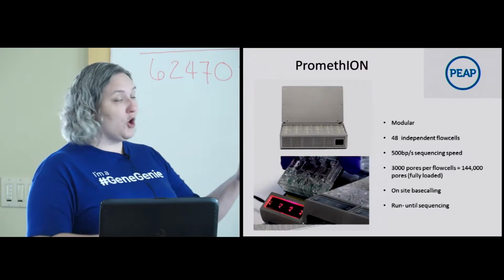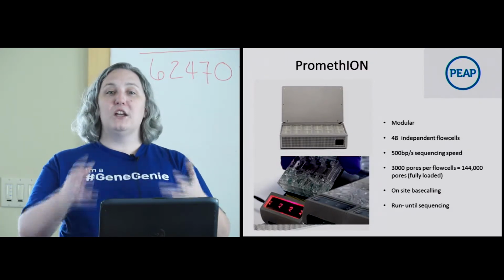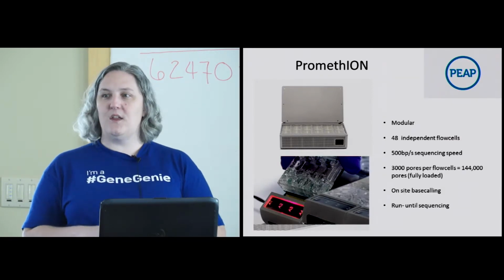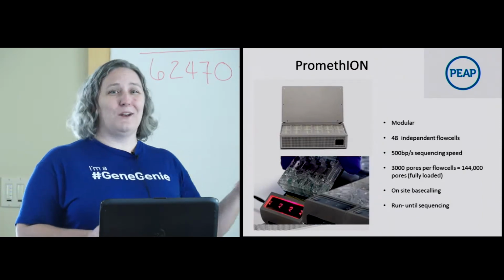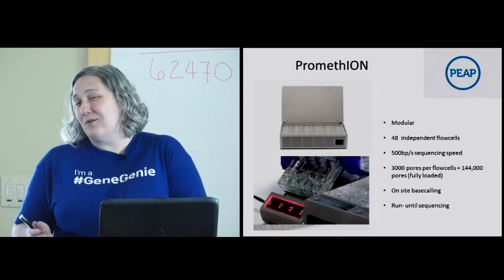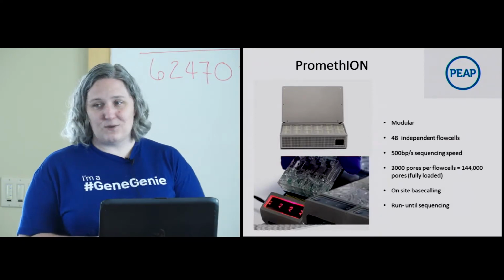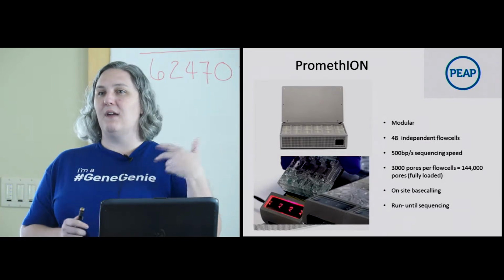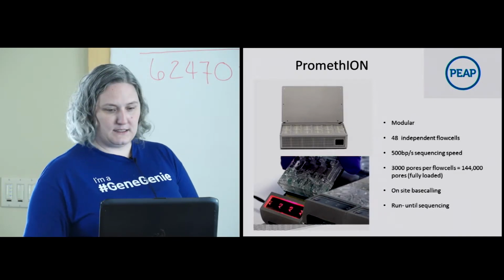So you start your run until sequencing, you start getting real-time data, and you run until you're confident that you detected what you're looking for, and then you stop. And then you stop paying for reagents, you stop paying for time. Maybe it only takes an hour to get to that data point, 2 hours, 5 hours. Supposedly, this should reduce your costs. This is not available yet, so I can't speak to how well it works, but this is kind of where they're going, making a very new and different paradigm for how you're going to perform sequencing science.